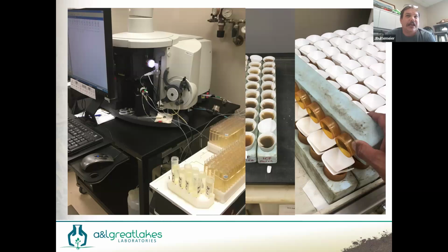In the past, we used to have to put a color developing chemical with it, and it would turn color. The darker the color would be, the higher the concentration. Well, that was an extra chemical. That's another chemical to dispose of. In this situation, we're using very weak organic acids, acetic acids, and those kinds of things, very common acids that are not heavy metalled. They're not hazardous waste. And when we put it in the ICP, there's no additional chemistry added.